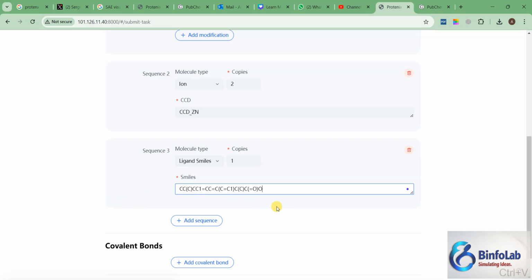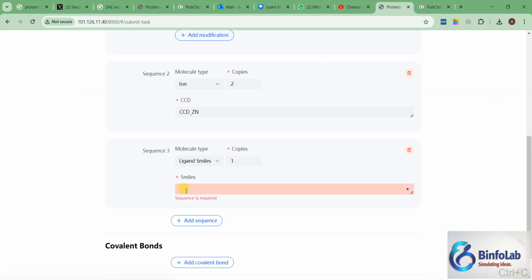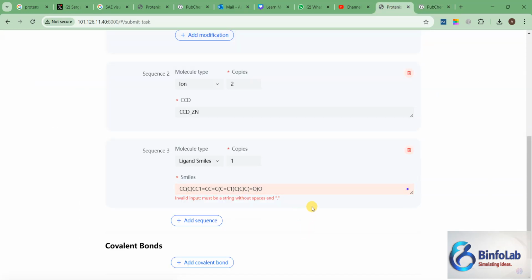it's okay. But now also let me show you, don't make this mistake. For example, if you copy like this, you see, it will give probably an error. You see? Why? Because if you see here, there is a space during the copy. I dragged it here so I can see a space. So now how to fix it? Just backspace. Now there is no space and now it's done.